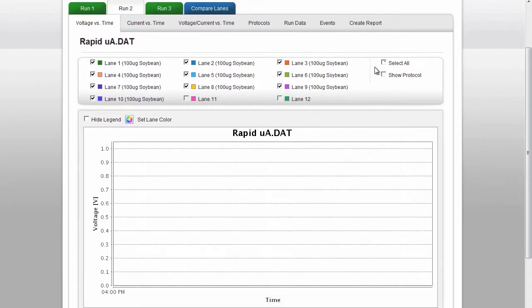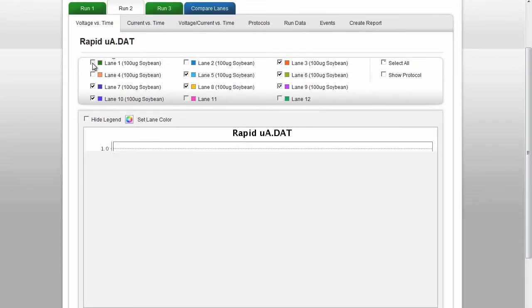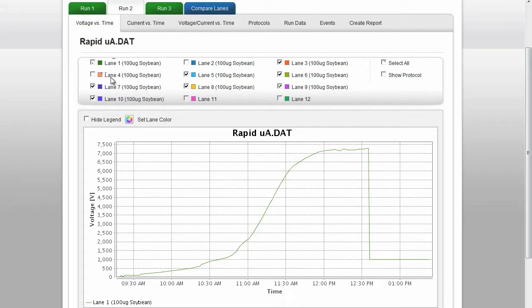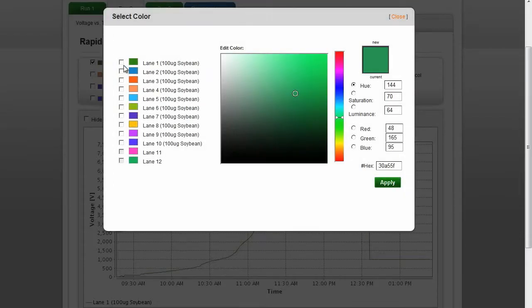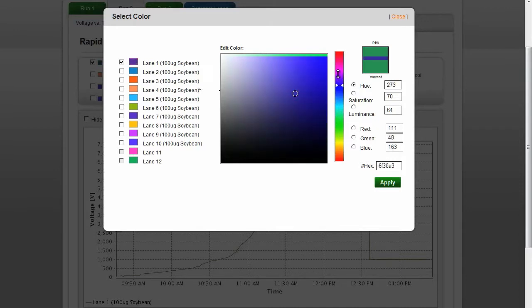You can change the color of the lanes by selecting Set Lane Color. Choose the lane whose color you would like to change, select the color, and click Apply.